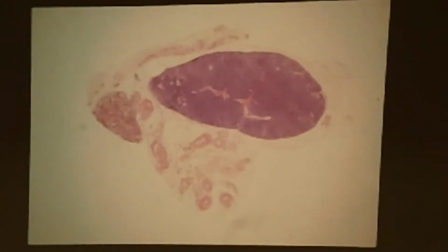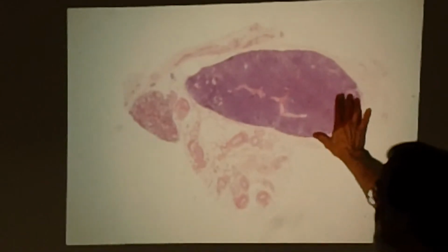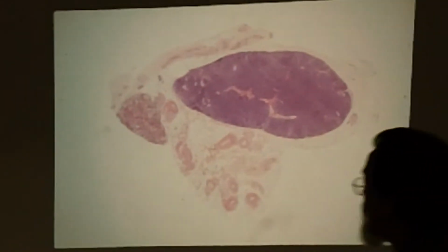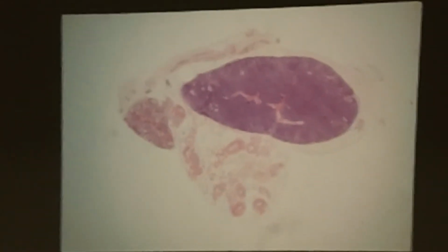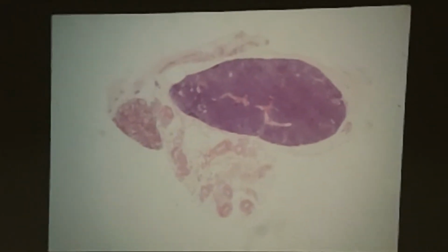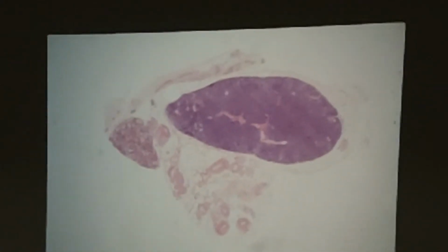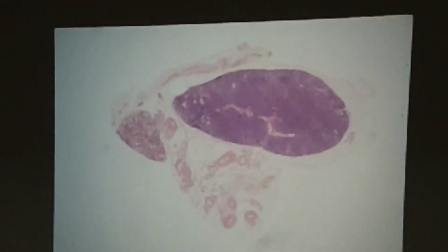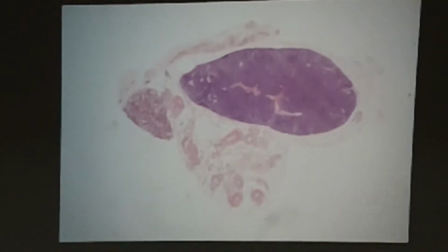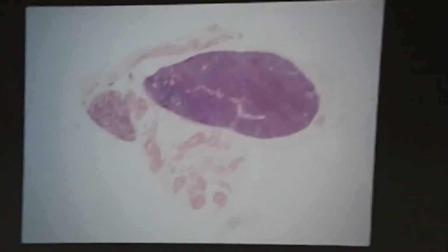A nice shot because it shows the parathyroid in its entirety in association with some thyroid gland. Keep in mind that we will show you good specimens or micrographs, right, Nigel, for the exam, all right? So again, if you're not happy with the quality of the slide, that doesn't mean don't look at the slide, but go to your ancillary sources.